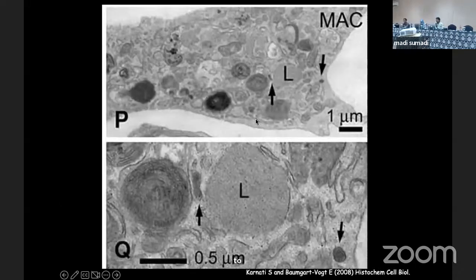So it's a macrophage. We know by biology that macrophages have a function, phagocytosis. Phagocytosis occurs through lysosomes, so a typical property is that they should have lysosomes. So these are the lysosomes. If you have lysosomes, then you're right, it is a macrophage. If you don't have lysosomes, then it's not a macrophage. You're looking at some other family.